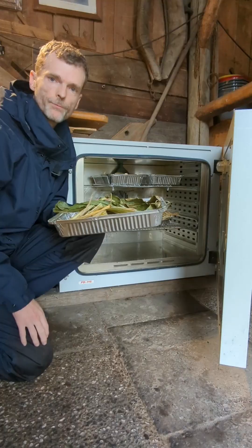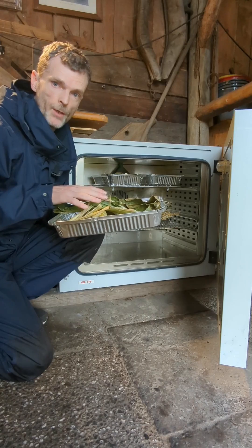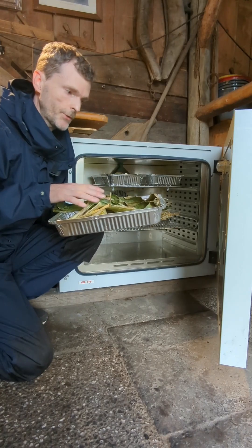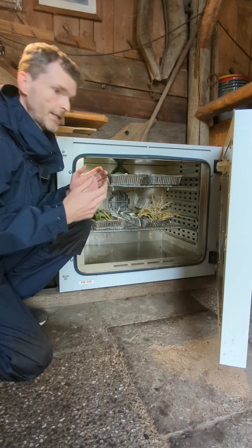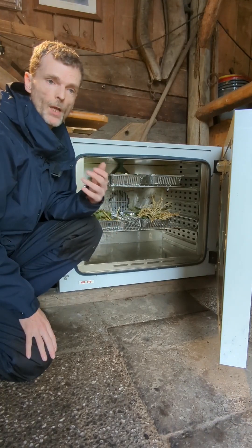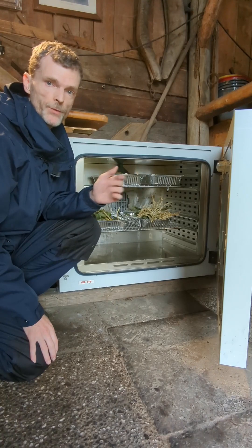Let's find out. Before we can convert the biomass into biochar, the biomass needs to be dried first. I'm using a special ventilated drying oven for this, where I will dry the biomass for a couple of hours at about 105 degrees.